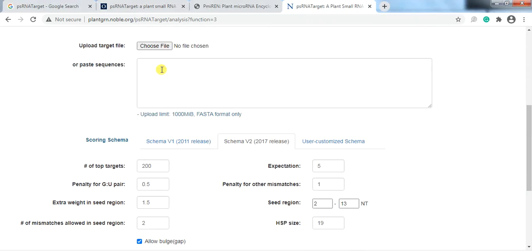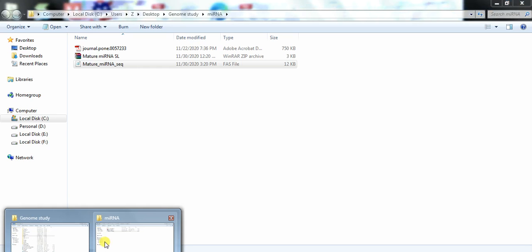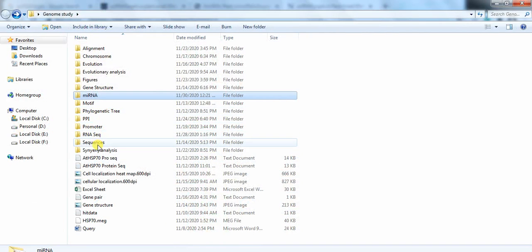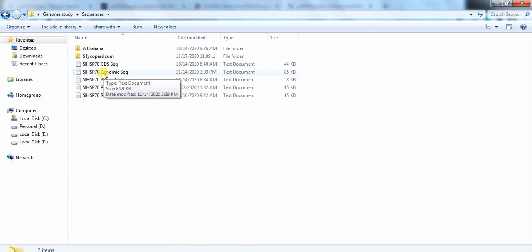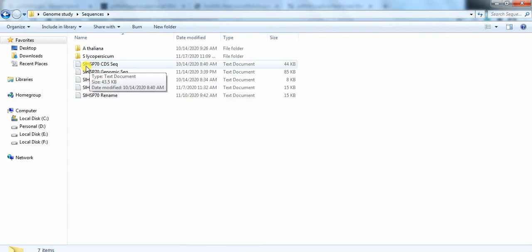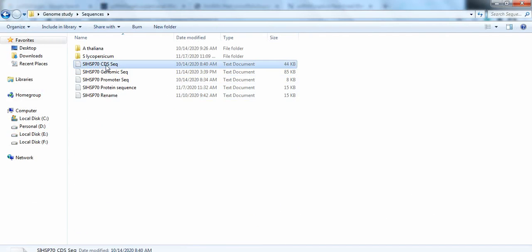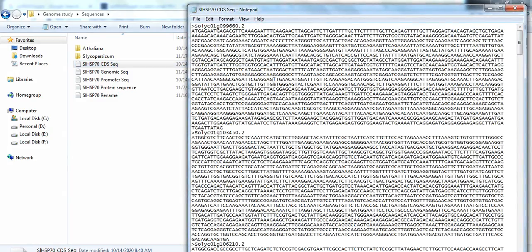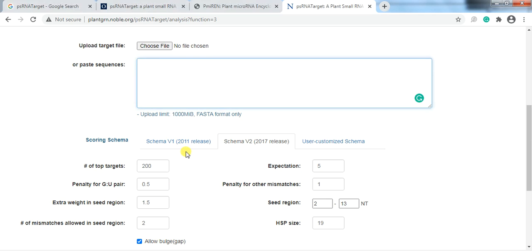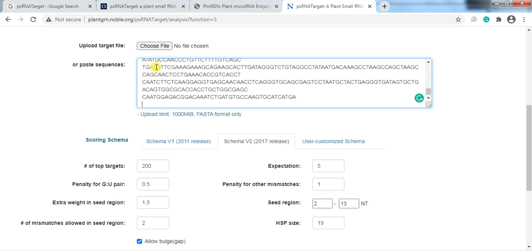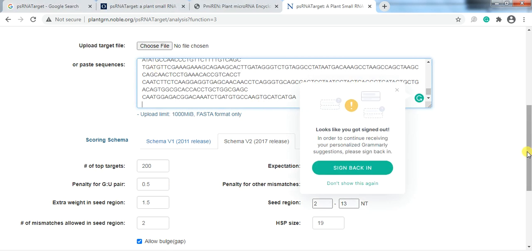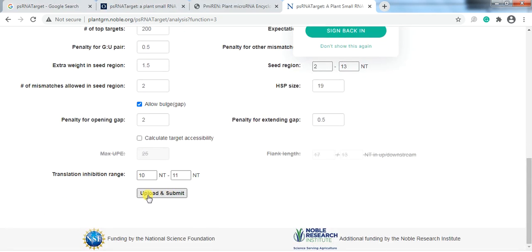Now paste the CDS sequences of your protein family genes that you have already downloaded. We have around 70 CDS sequences — select all, copy, and paste them here. Then click Upload and Submit.